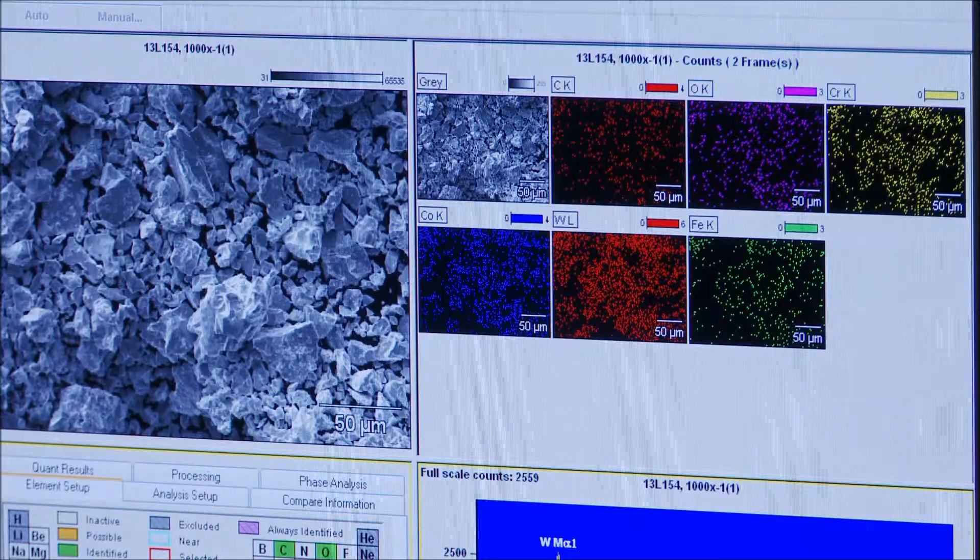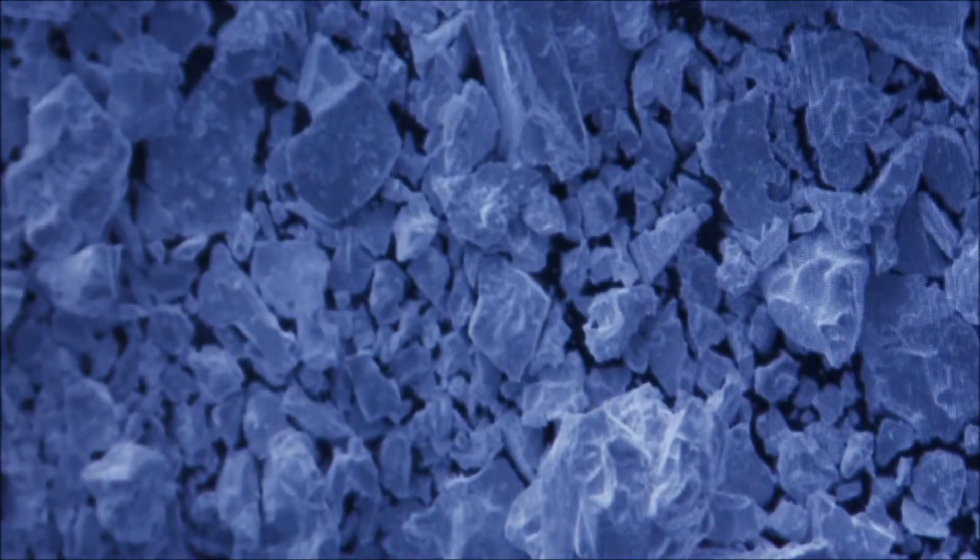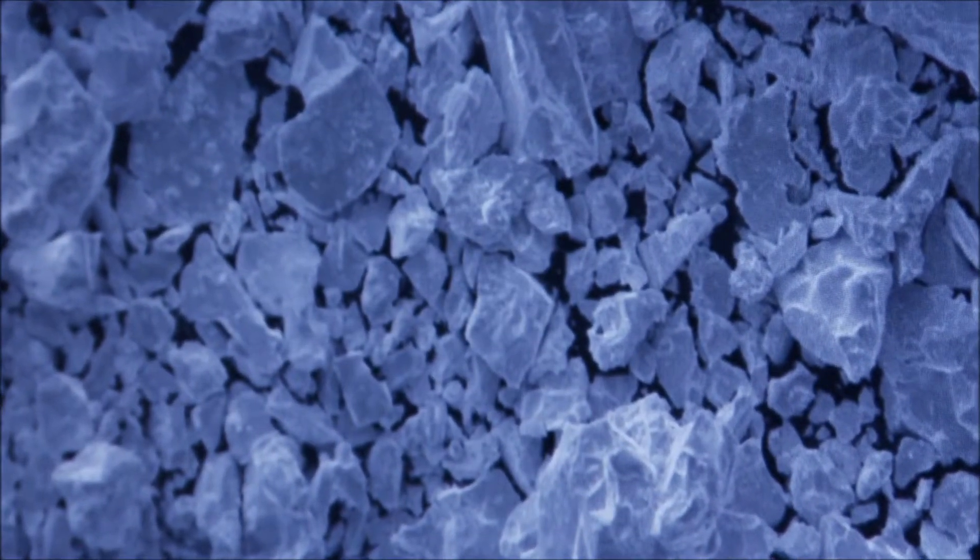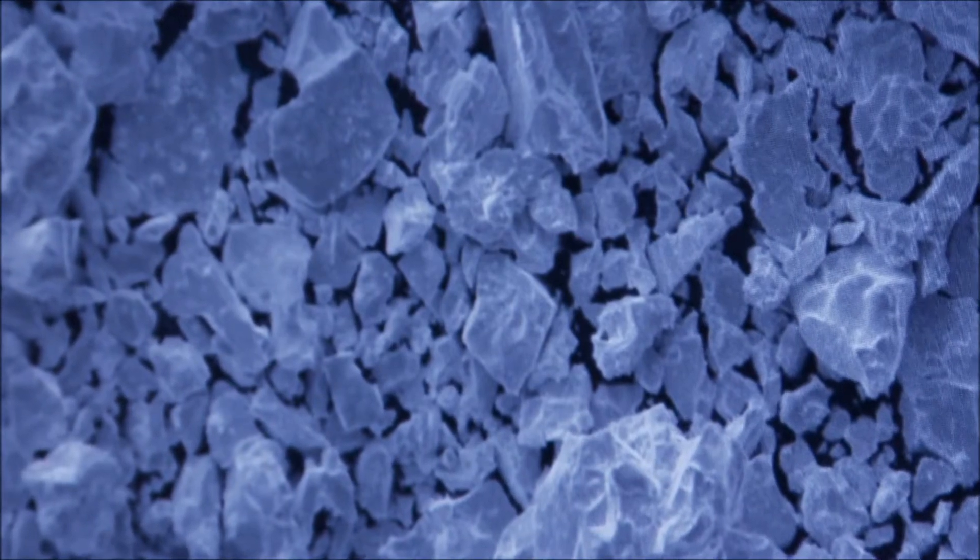We also use this microscope to characterize any new coatings that we're developing or identify any unknown particles that might be existing that might be leading to a failure or that might be actually benefiting from our new coating technology.